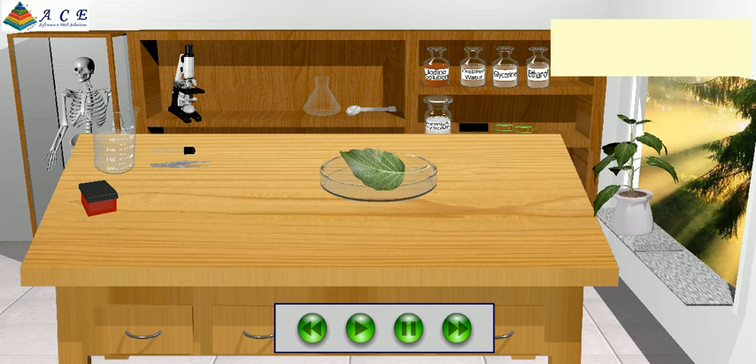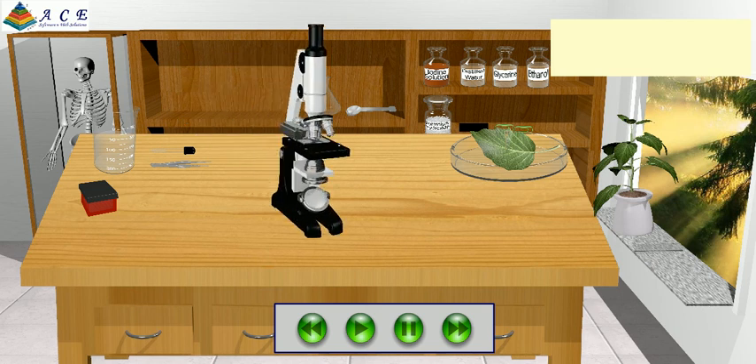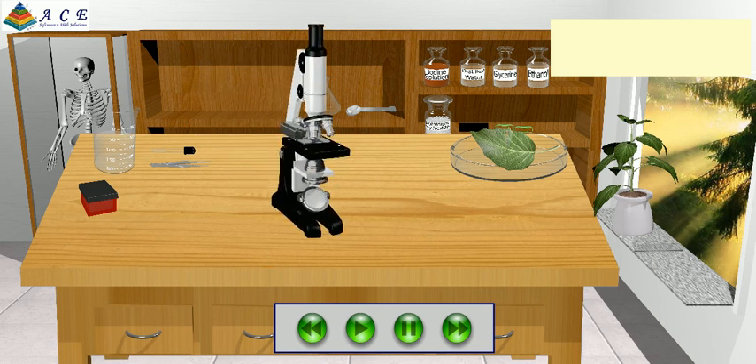Take the microscope on the table and observe the leaf peel under the microscope. Click on the microscope to focus. Observe that the stoma gets widely open after exposing to sunlight. Keep it in the dark for some time.